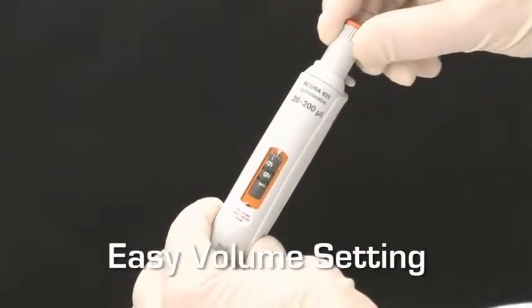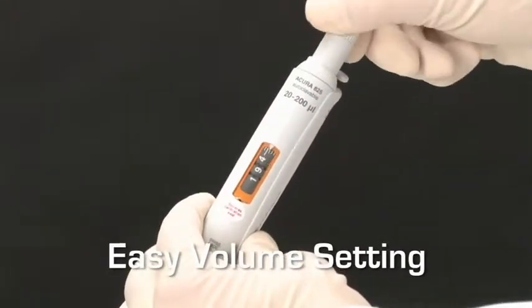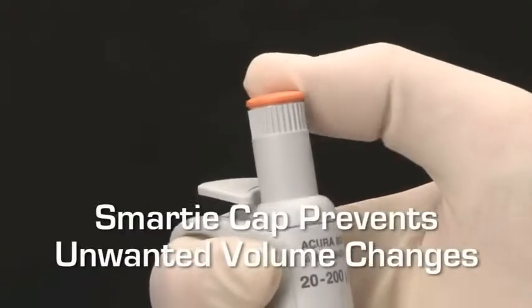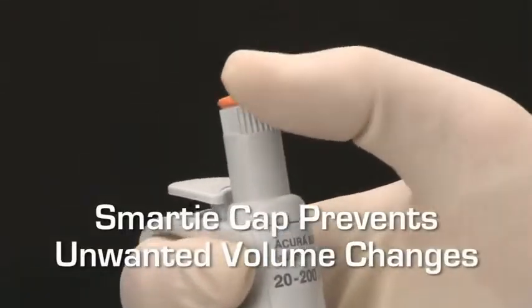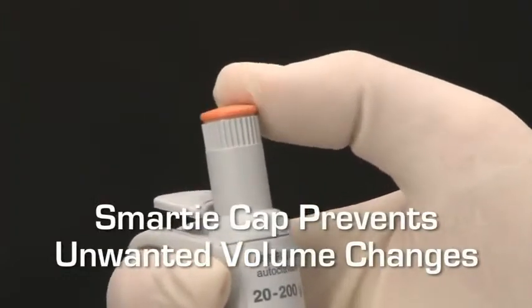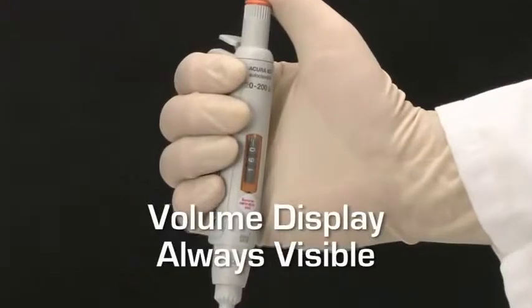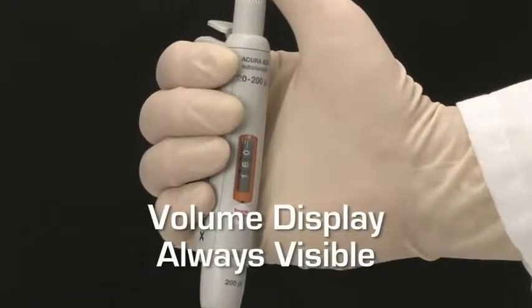Setting the exact volume to be dispensed with all Acura Manual Pipettes is simple and precise. Once selected, the free rotating color-coded cap prevents any unwanted volume changes from occurring during use. For positive verification, the contrasted volume display is visible anytime.